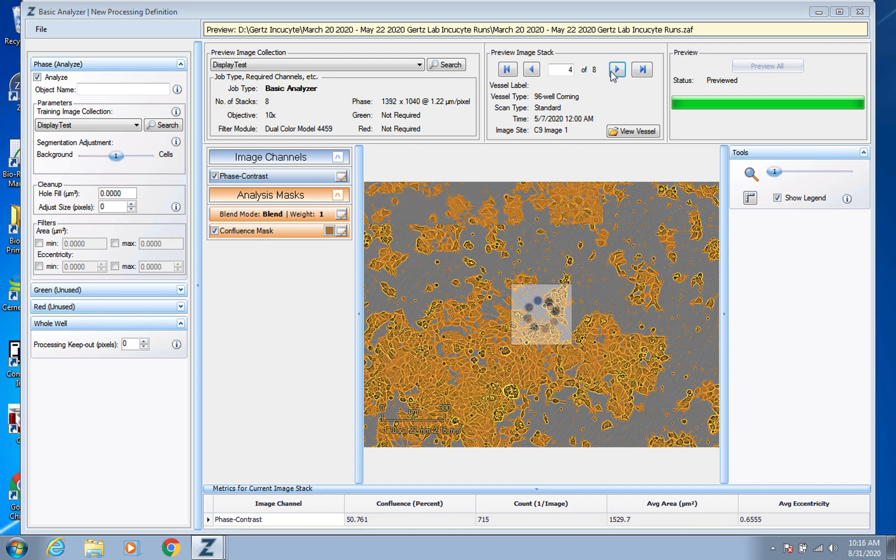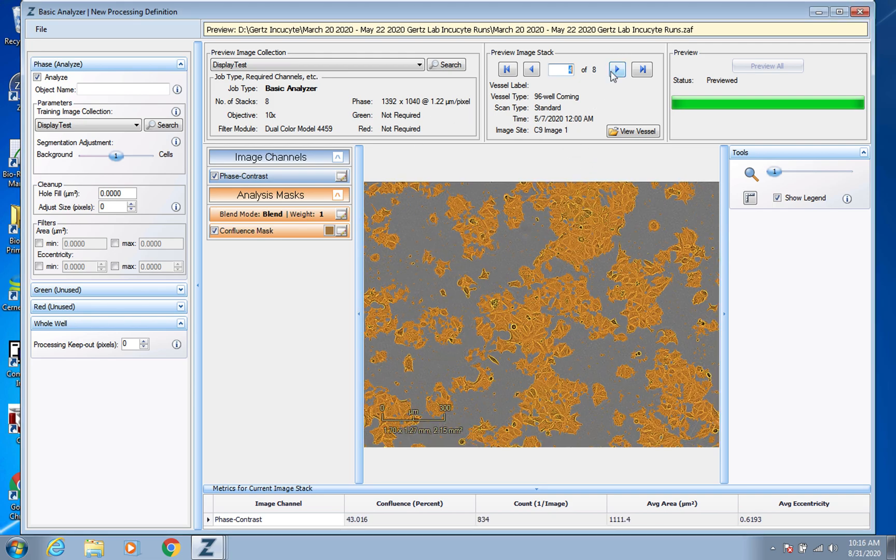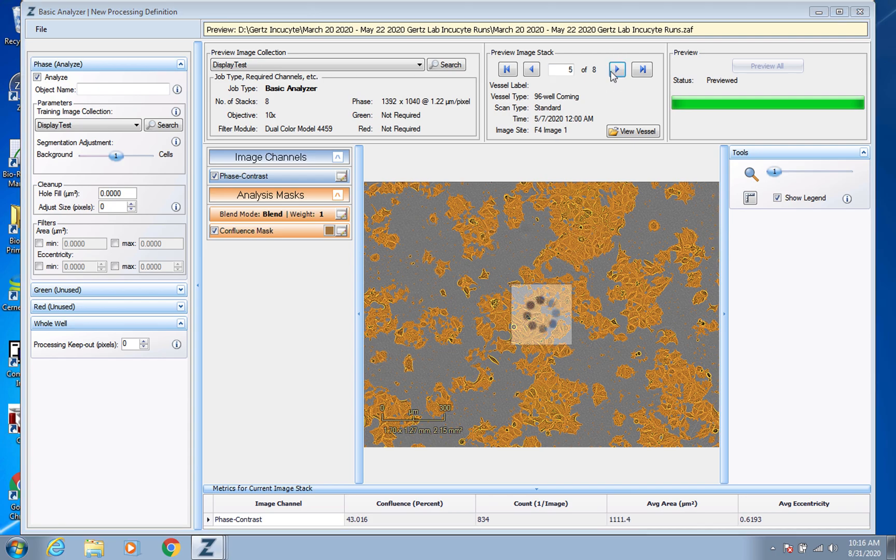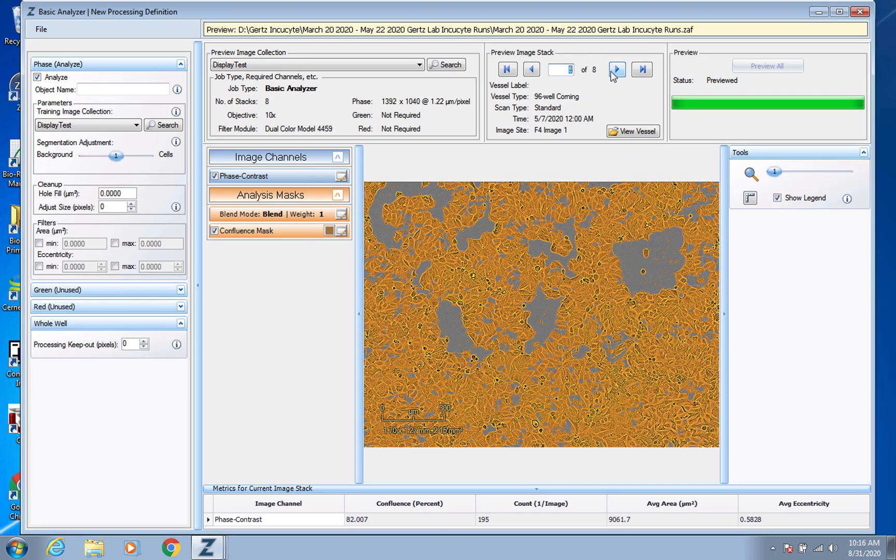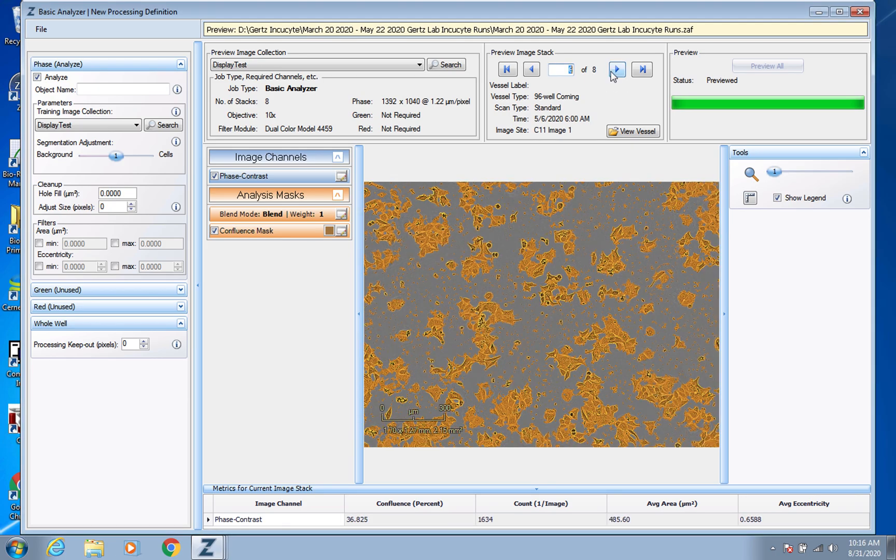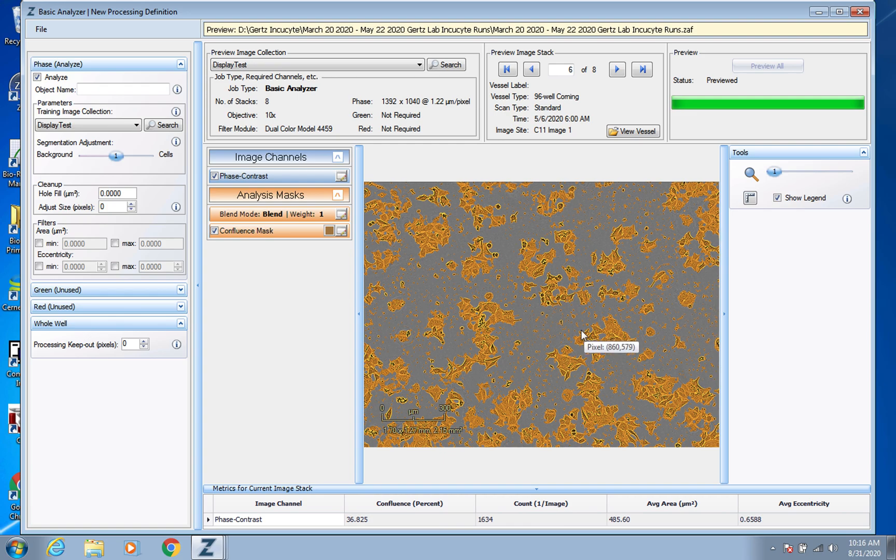So overall, this actually looks pretty good. And I think that's the useful thing about picking so many images for it. Here again, you can see that might really be throwing it off.